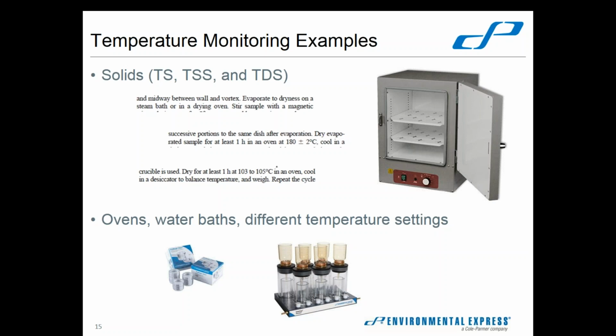So that's talking about your temperatures for your various gravimetric things. I didn't put it in here, but oil and grease is another one that has a temperature mentioned in the solvent evaporation stage, and I believe previously it mentioned 65 degrees Celsius, which does just fine.